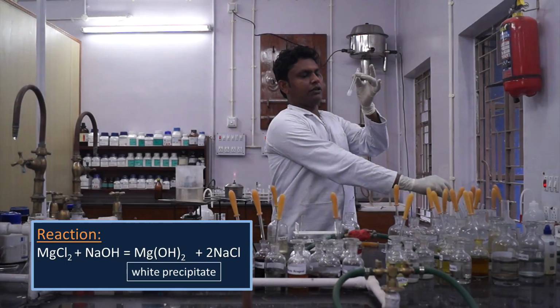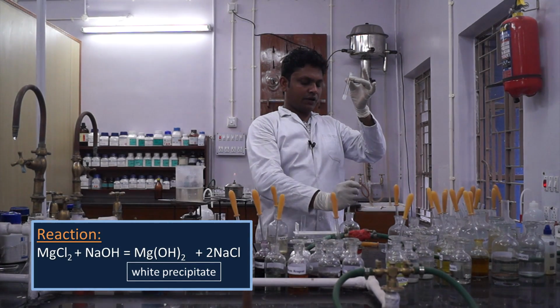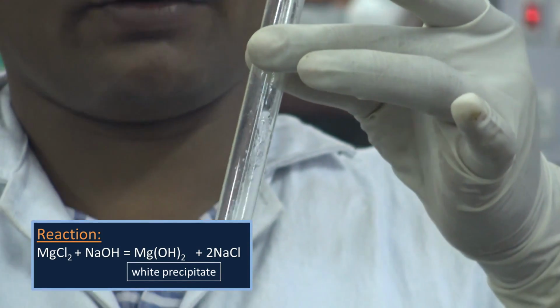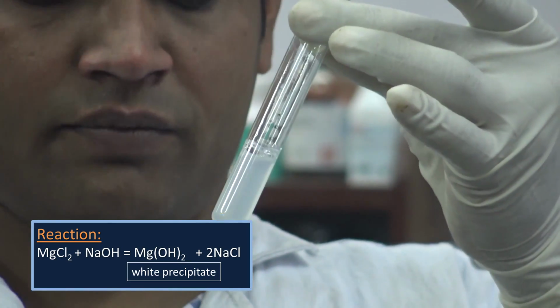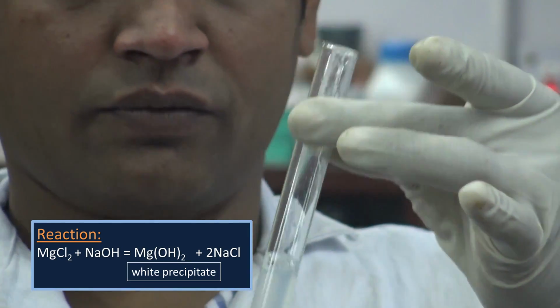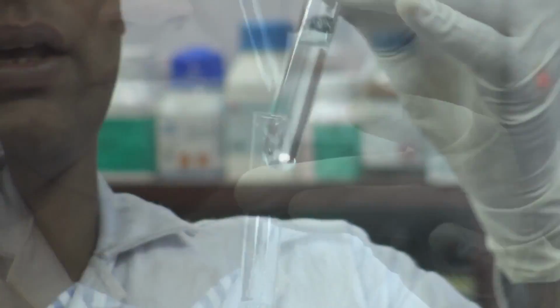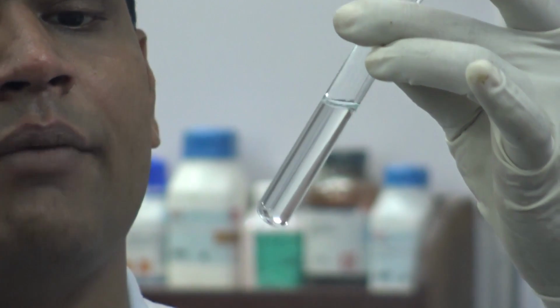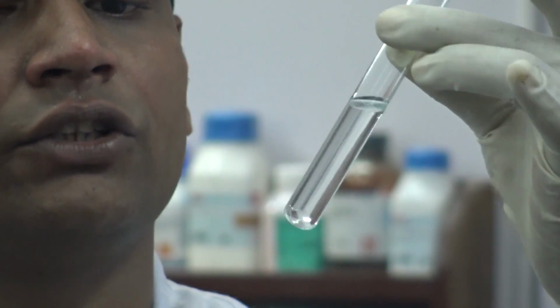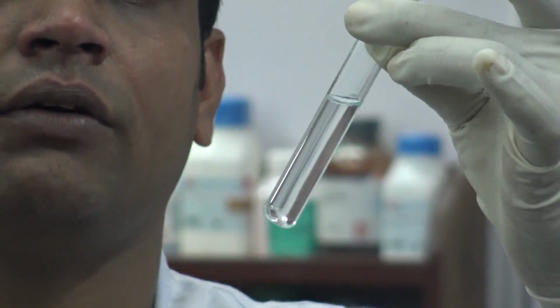This precipitate is soluble in ammonium chloride solution. Here you can see the white precipitate is clearly soluble in ammonium chloride solution. This confirms the presence of magnesium in our solution.